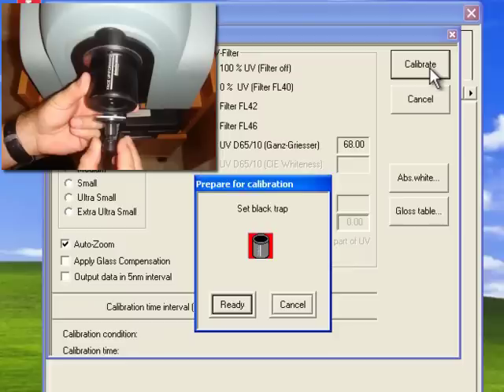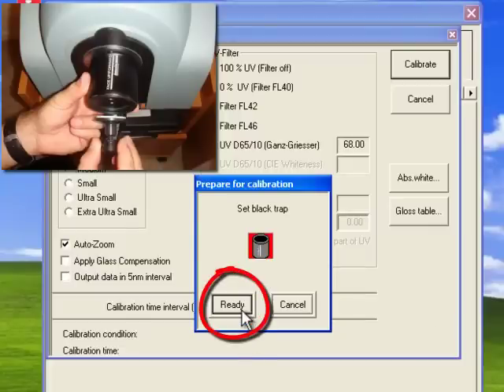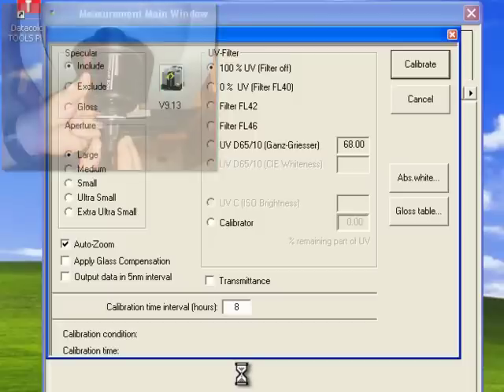Place the black trap pictured here on the instrument with the opening of the trap lined up with the opening of the spectrophotometer. Press Ready.